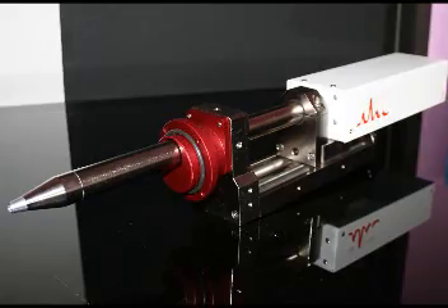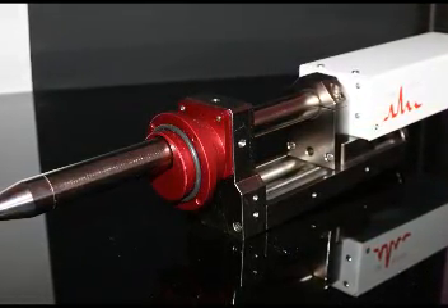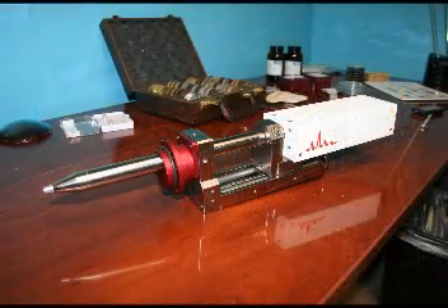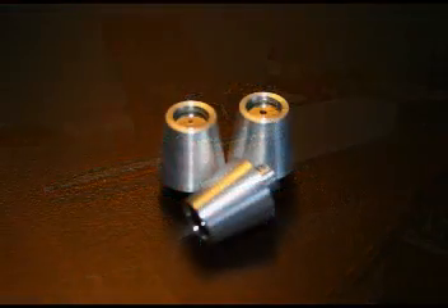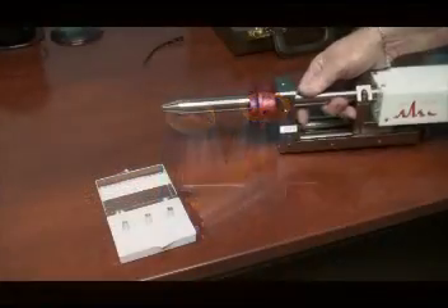The MicroFX SIM tube is a low-powered x-ray tube operating at 35 kV and 100 microamps. The high voltage power supply is integrated with two interlocking vacuum sensors, which shut off the x-rays when the SIM chamber is vented.